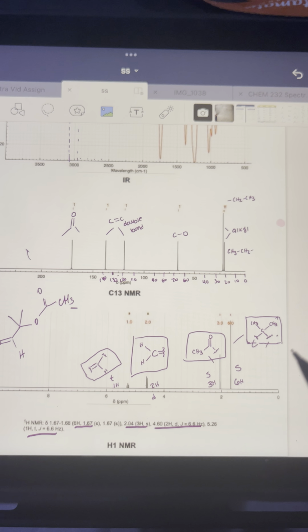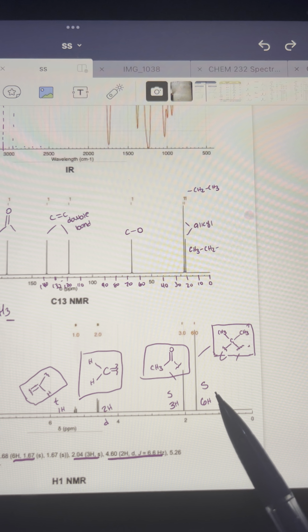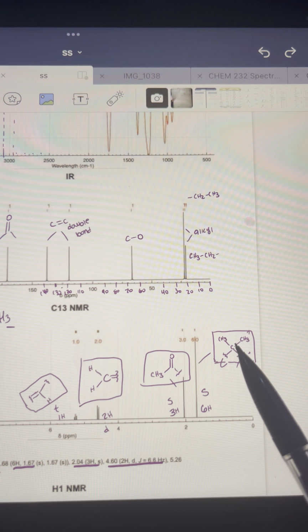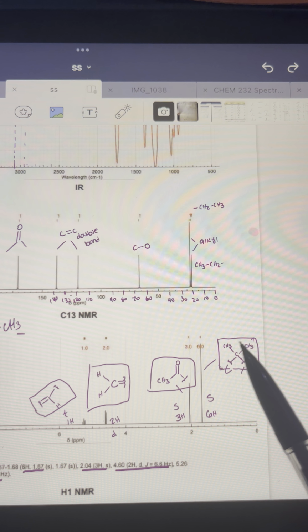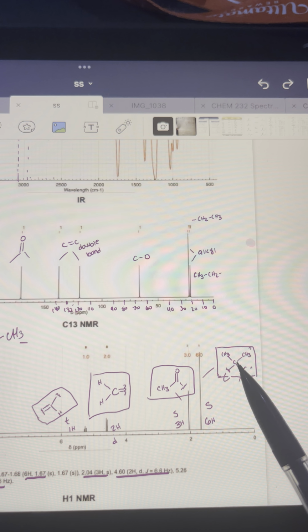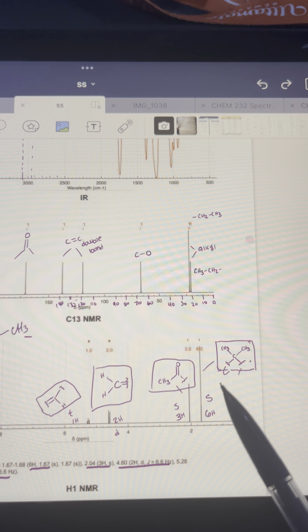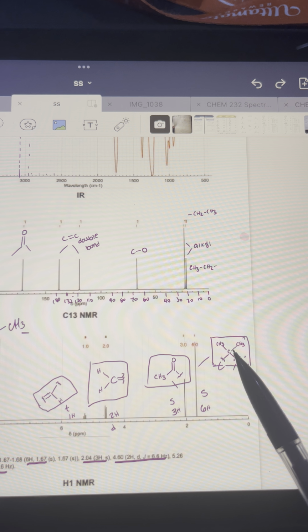So now observing proton NMR, at the first peak, we see we have an integration of 6H and a singlet. So that probably means that we have a carbon attached to 2 methyl groups, like an isopropyl group essentially. And it's a singlet because there's no neighboring hydrogen. So we know that there's not going to be an implicit hydrogen here.